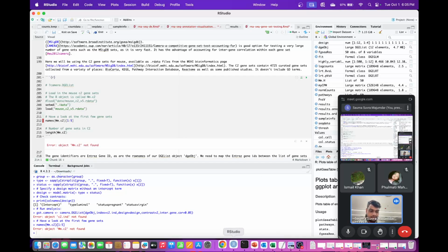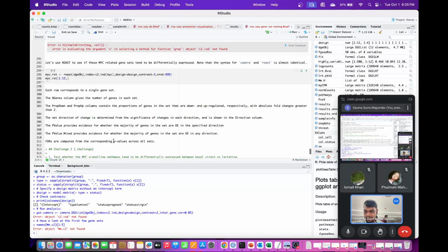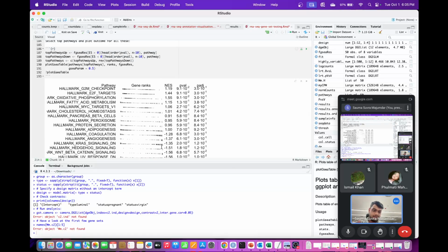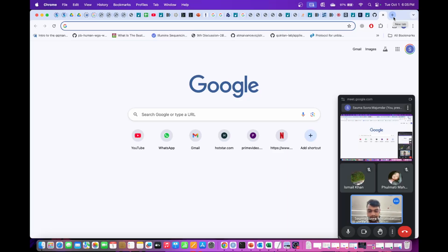Okay, I have to download that. I don't have it here, so I'll not go into this detail here. Just wanted to show you how this looks. So basically, we have done till here, the enrichment scores and the p-values. If you want to see, I'll just show you here on the internet.